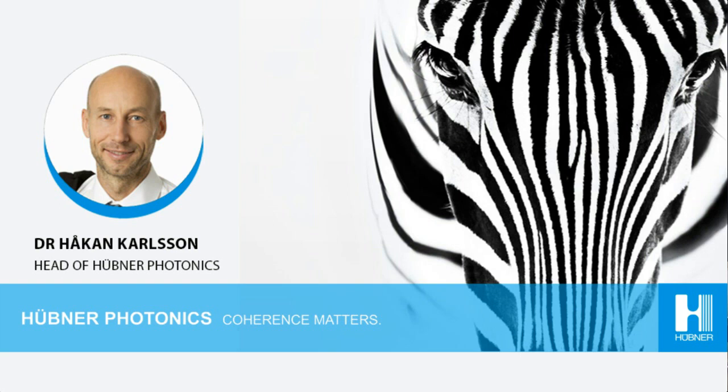So if the data sheet is missing a clear indication of what is specified for this laser, then one should get skeptical. I think it's also important to be able to see performance data, because even within the same kind of specification regime, there are differences in how the lasers perform from different manufacturers.